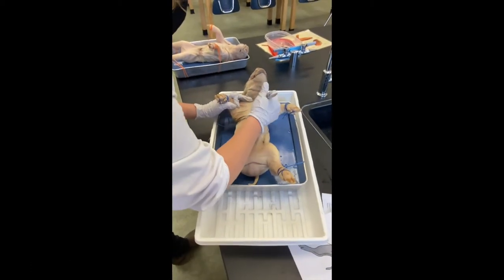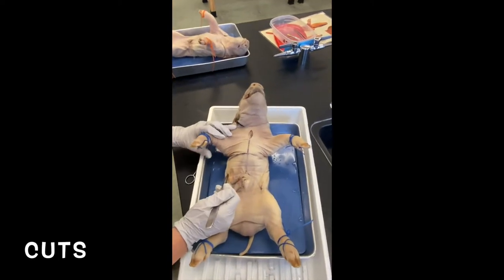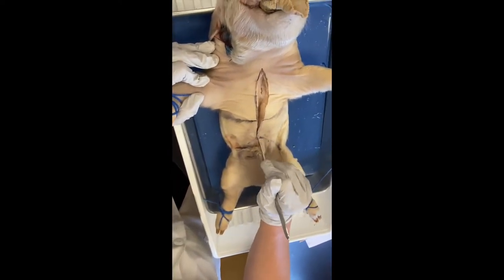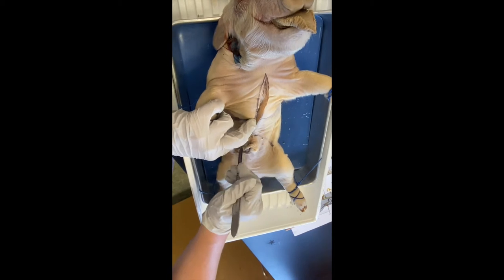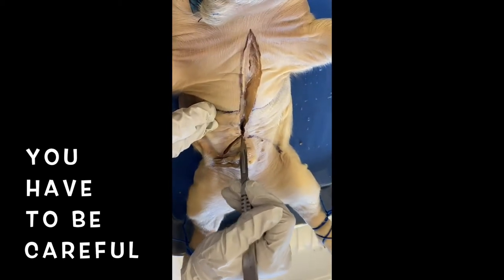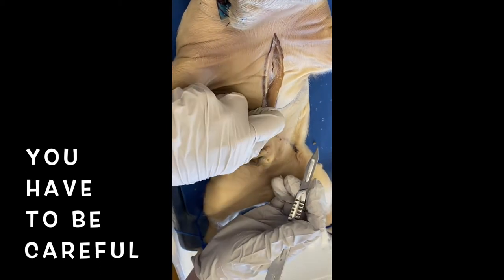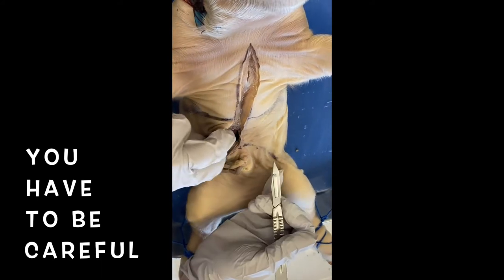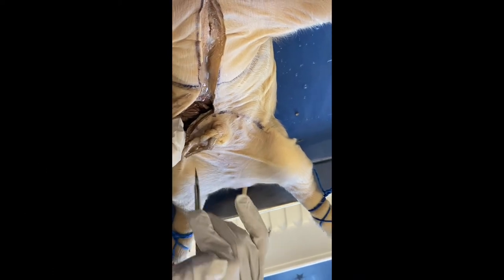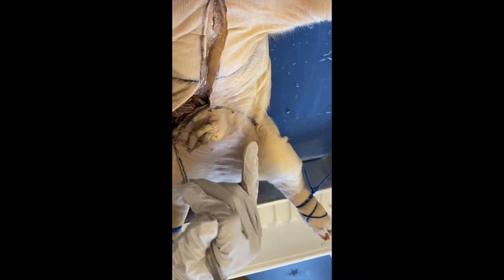I'm going to go ahead and start making some initial cuts. I'm giving it some pressure, this is how it is in real life. I told you guys I saw a human autopsy. Just give it a little pressure, it comes through. If you were doing it, it all depends. Some of you are a lot more confident, and this is where you have to be careful, because we're going to see how well I do. I don't want to push down in there because then I'll nick something. As I start to get in, you can see I'm into the cavity. I can pull the skin up. That makes it a lot nicer, and I don't hit any organs.